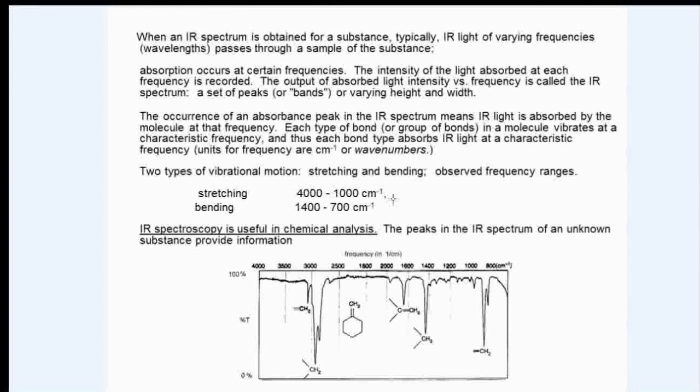All right, let's look at an example of a molecular compound absorbing IR light. It will produce what is called an infrared spectrum. For example, we'll use a compound whose structure consists of a 6-carbon ring with an external carbon-carbon double bond.